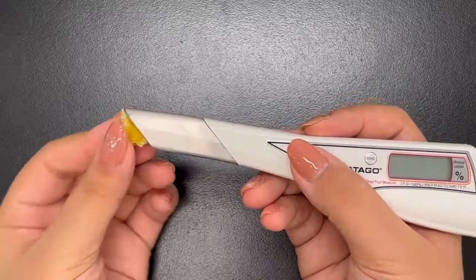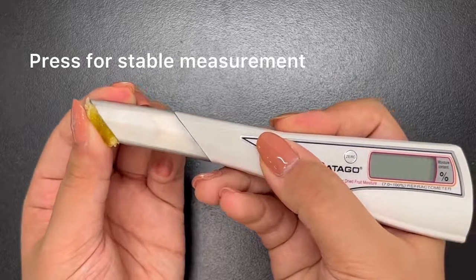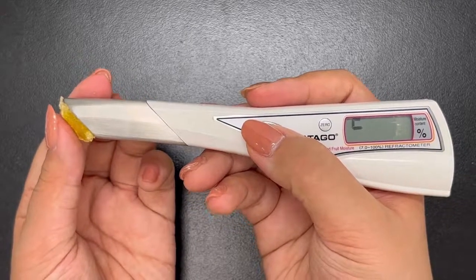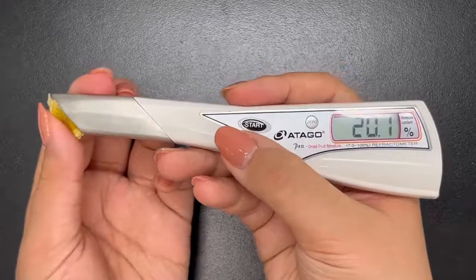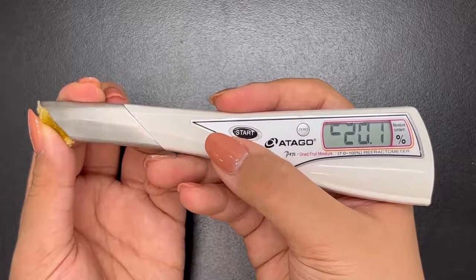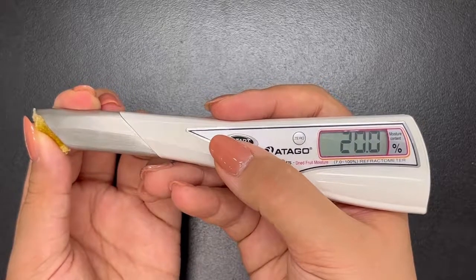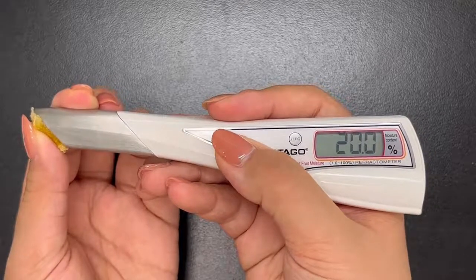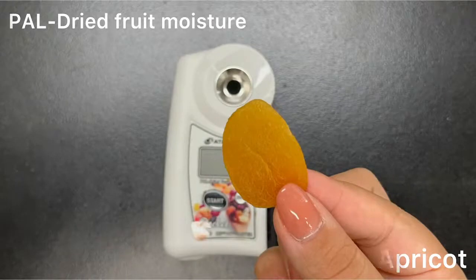Now let's see pineapple measurement with the PEN Dried Fruit Moisture. It's the same as with the PAL — you press the sample firmly onto the sample stage to get a stable measurement. Press start, and keep pressing the dried fruit while it measures continuously. As mentioned, there is continuous measurement, and you can see the value goes up and down slightly. Once it is stable, press start again and it will stop measuring. A blinking light on the body indicates that it is measuring.